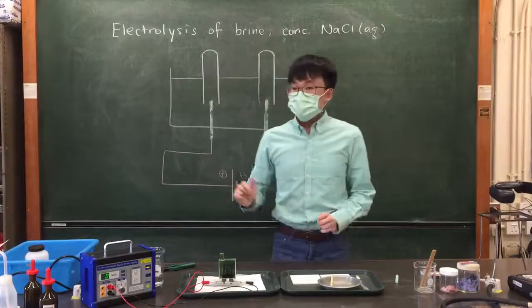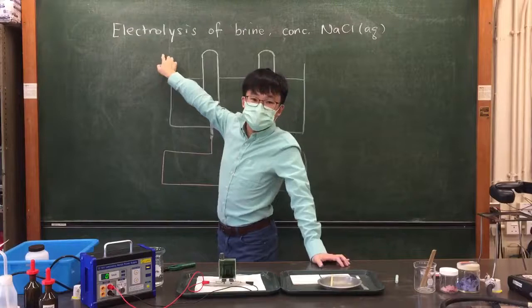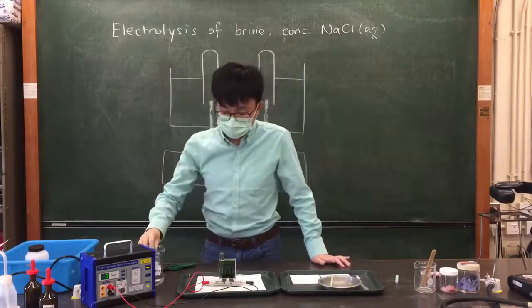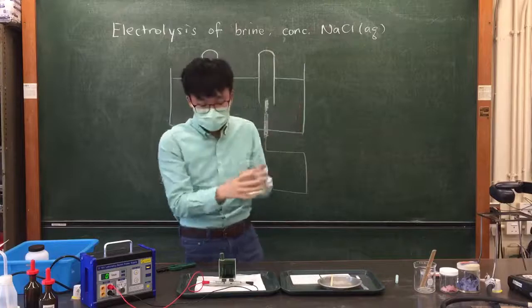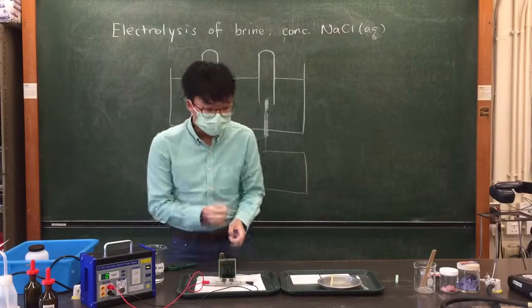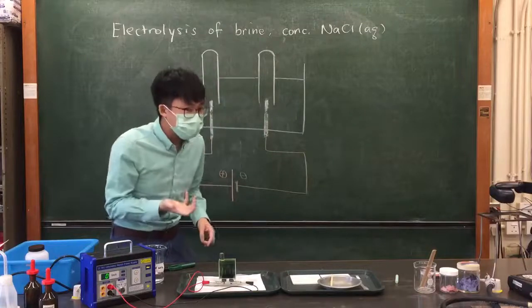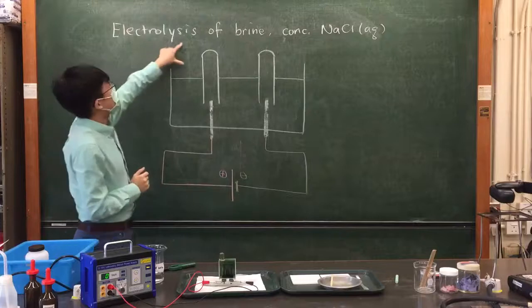So hello girls. Today we are going to perform the experiment on the electrolysis of brine solution. Of course, I have prepared a beaker of brine solution which I have inserted into the box of the electrolysis setup here. And I would like to review with you what we have been learning before, that is electrolysis.